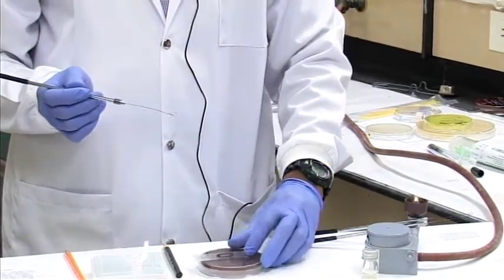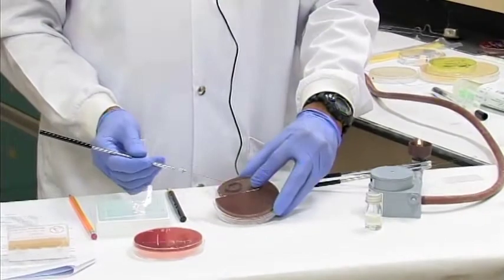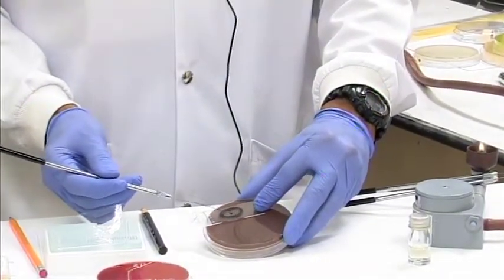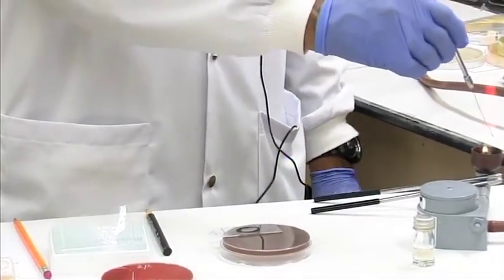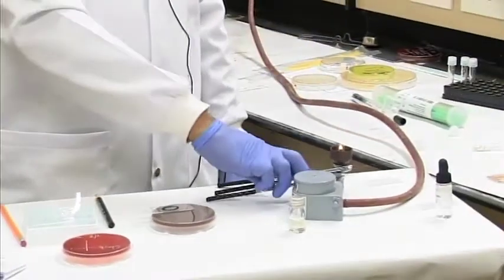Then we're going to apply this to your slide. I'll turn it sideways so you can see it, and just emulsify it a few times within that ring circle. That's it, a few swirls is all you need. Spread it out on the slide, and then of course flame your loop again and place it down to cool.